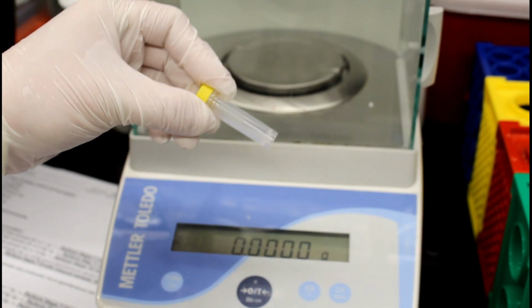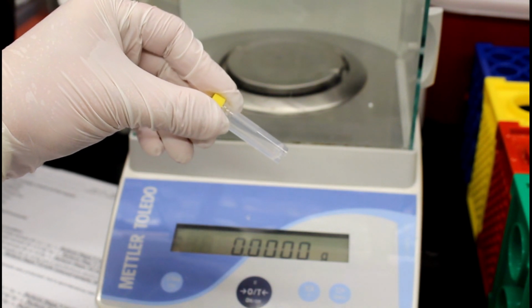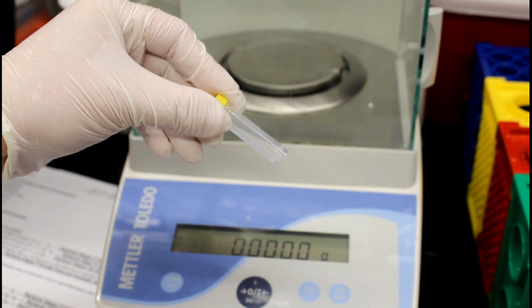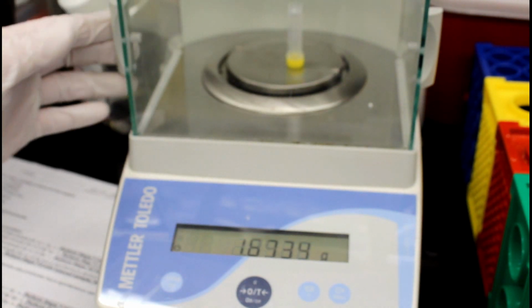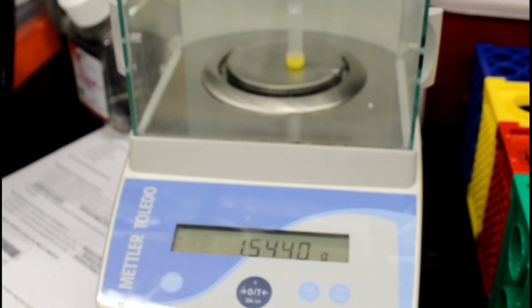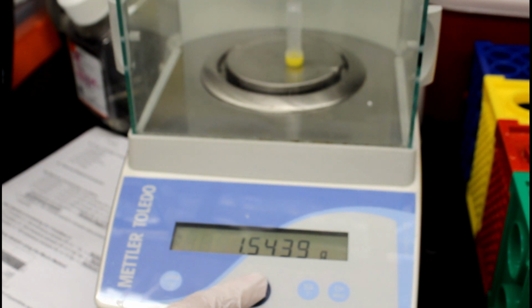The next step is from the remaining sample, we're going to process for the microbiology endpoint. First, weigh an empty microcentrifuge tube on the scale. Next, zero the balance.